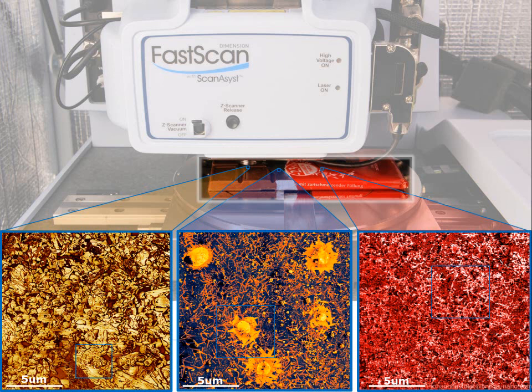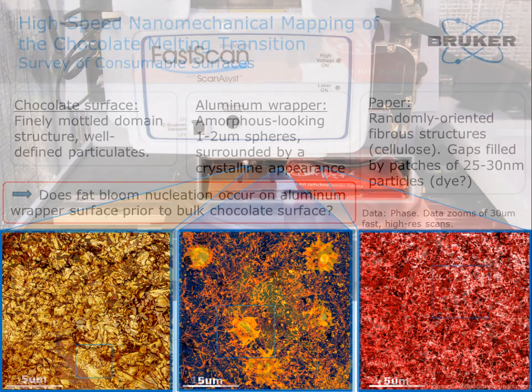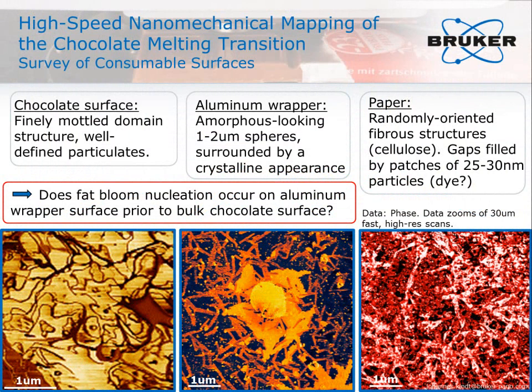Each has a lot of long-range heterogeneity that can only be seen in a large scan. Now we will zoom into the blue boxes and see that each also has enough nanoscale detail to require the high resolution. Here are the 3 data zooms from the blue boxes in the previous slide. The large scans gave us the context to know we are looking at representative morphologies. These zoom-ins now give us the detail for some interpretation.